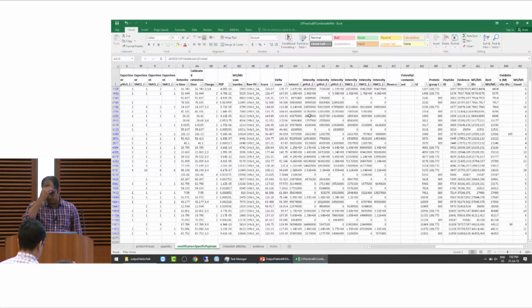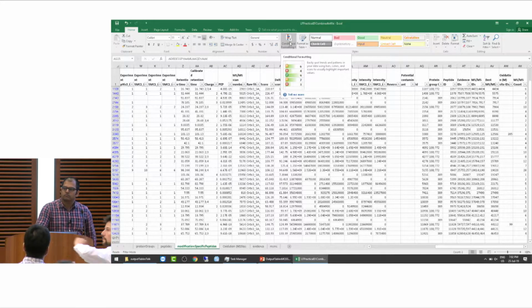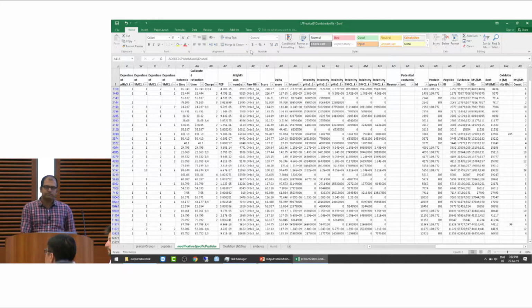Yeah, peak intensity. Is there somewhere an integrated precursor ion area? So that would be maybe for SILAC? I think there must be a setting somewhere where you can switch how the intensities are calculated. So it's either the value at the peak or the integrated area. And I think there are two more options, like first you model it with some fit and then it takes the maximum of this. I can show you the options later.